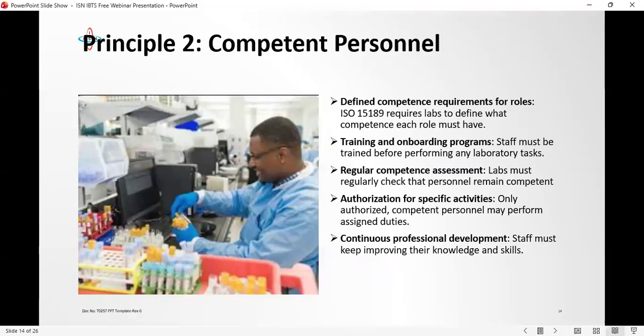And you need to have regular assessment, be it by somebody or the lab manager or the quality officer coming to check. You read the SOP. You now come and see, are they following through on what they are doing? This thing that they have said they are doing, are there any risks inherent? Maybe you brought in a new instrument, and the new instrument now tells you that they require only lithium heparin as opposed to the serum you are used to.